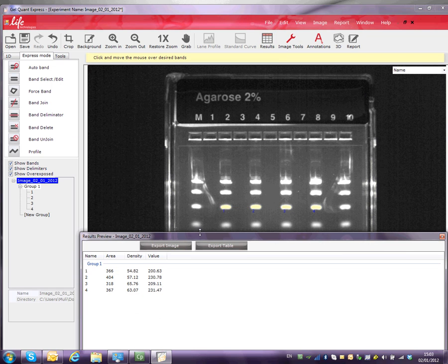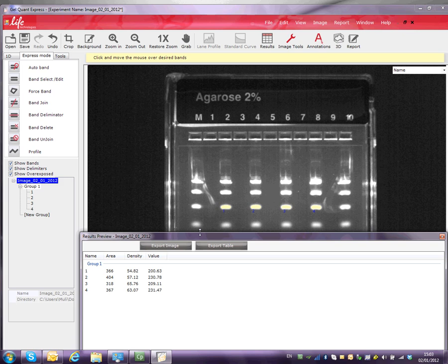Drag the Results table to see the comparisons. Look at the value to compare relative abundance of each band.